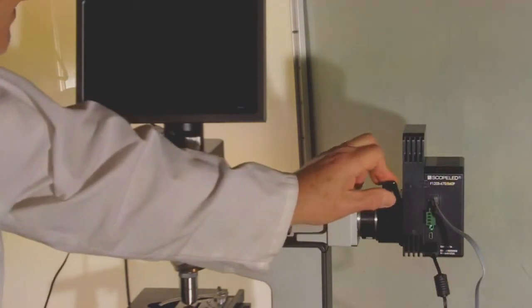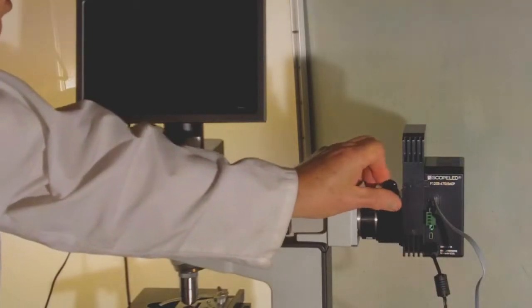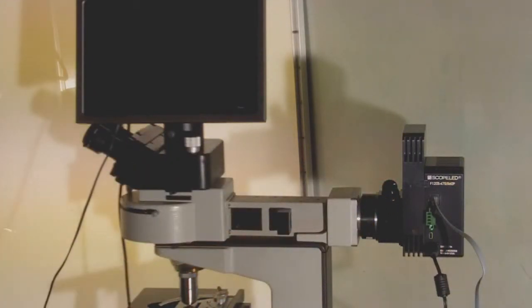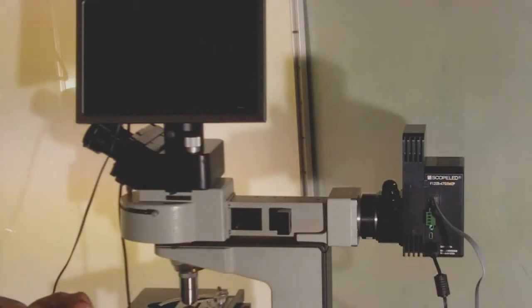We can adjust a collector lens to optimize the light for whatever objective lenses we're going to use on the microscope. For low power objective tissue fluorescence, you may want to disperse the light, homogenize it evenly across the field of view.